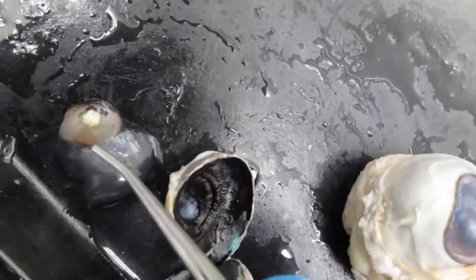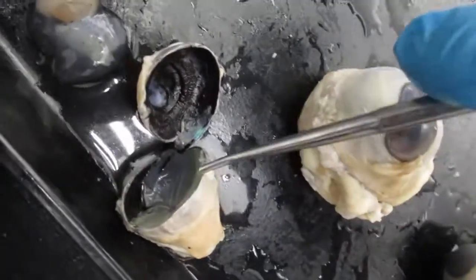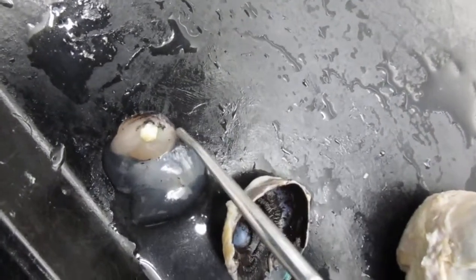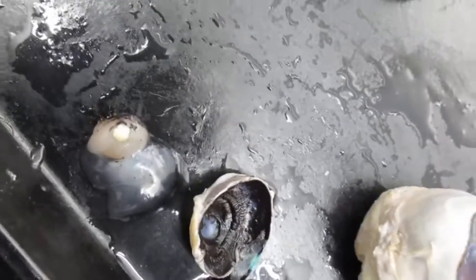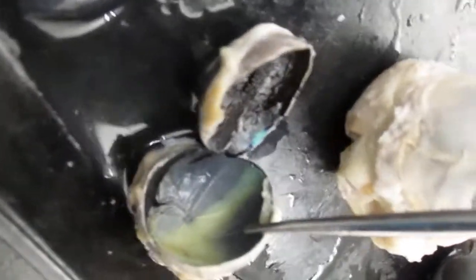And then you have this viscous stuff in the posterior segment, which was right in here. That's your vitreous humor. So your lens is going to be important in focusing the light, the focal point, to the retina.